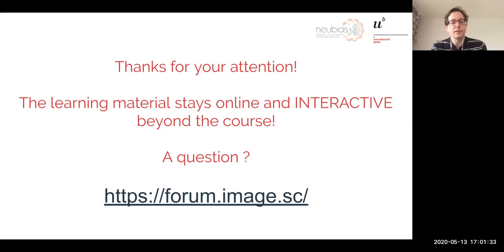These are quite similar. I would say for image processing, Python is clearly ahead, right? Especially because of all the deep learning advances that have been done in Python. Both TensorFlow and PyTorch, which are the main libraries, are written in Python and in lower level languages, but mainly in Python. So if you do image processing, I don't think you should use R. You can use it, as I showed, for the data analysis part, but not for the image processing at the moment.